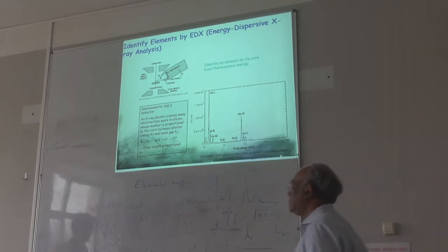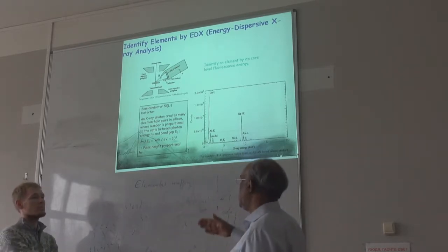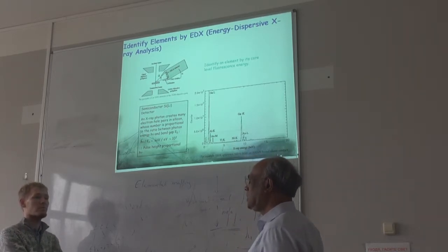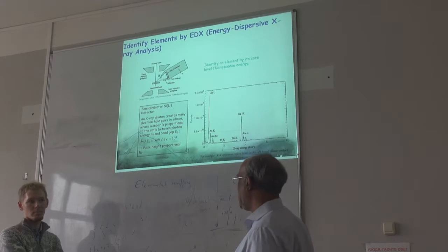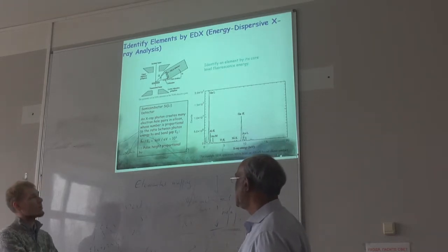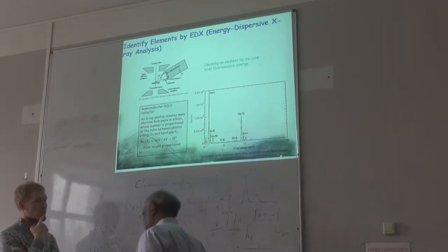Gamini, how does this sensor work? How can we measure? We have an X-ray sensor inside. And how does it work? We don't know. Okay, X-ray sensors are more like a scintillator. Then they have some photomultiplier tubes. So that's more like a radiation detector. Standard. Then we have something called energy dispersive.